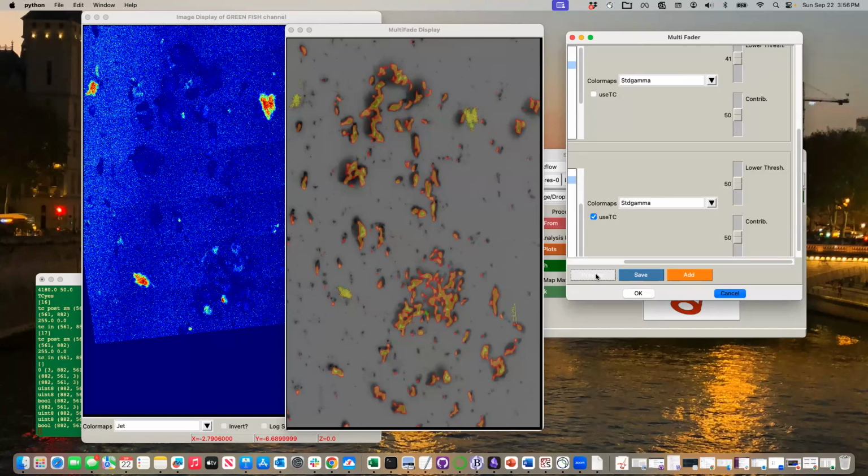So you can use these different oranges, reds, greens, purples, and blues and just set the thresholds so that you only show the top 50% of the data. So it only shows where you have the high data, and you have pastel-y oranges, blues, purples, greens. And you can kind of overlay different colors and make more than just your RGB. Cool. And again, we're always working for making cool artworks when it comes down to it, really.